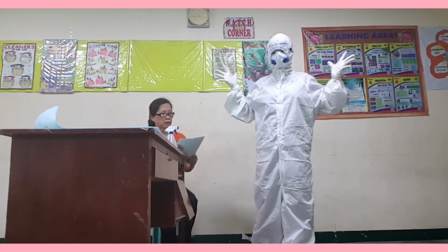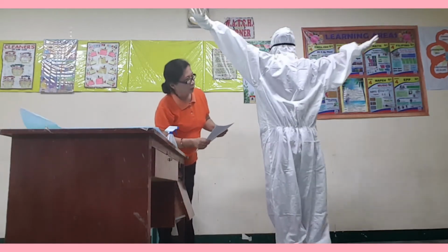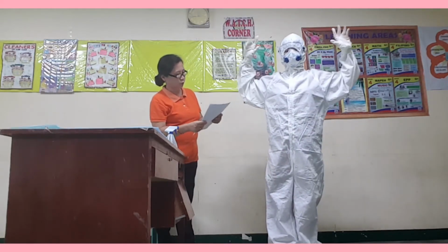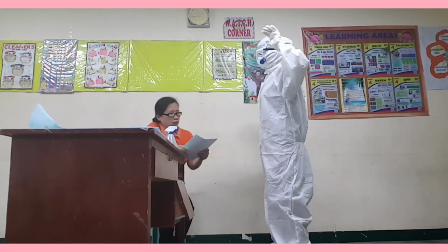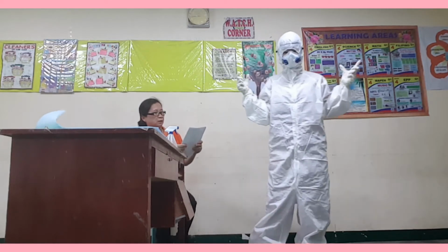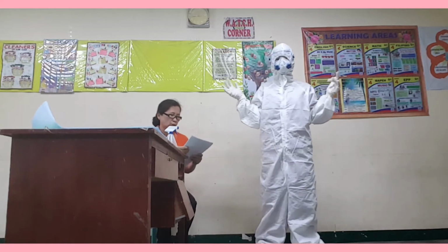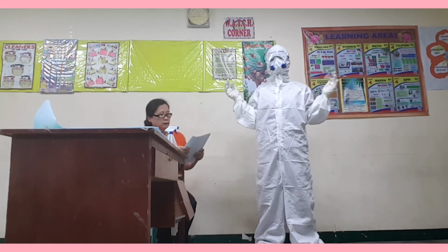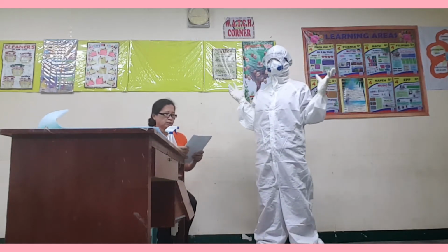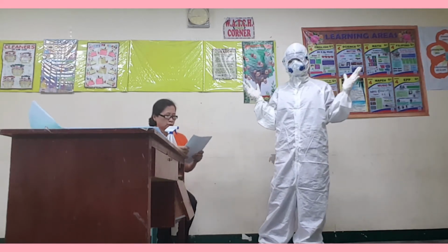Procedure number 4, inspect the PPE again. Assess the PPE for visible contamination or tears. If with visible contamination, disinfect with 1:10 bleach disinfectant wipe, to know if there is a sign of damage or contamination. Inspecting and disinfecting equipment after use decreases the risk of microorganism or infection transmission.